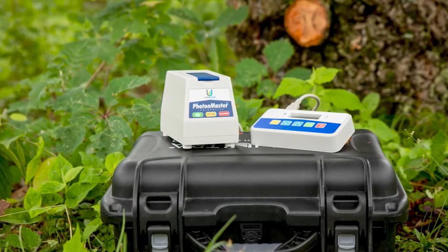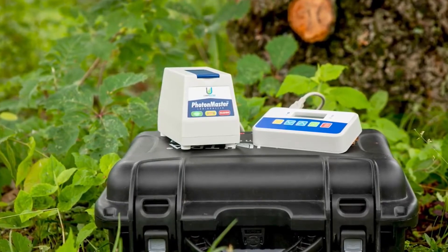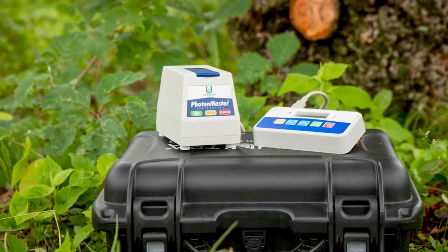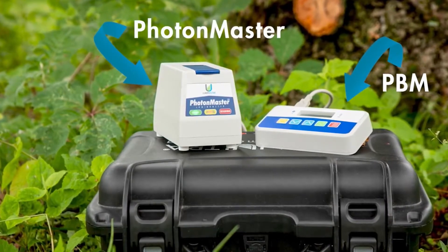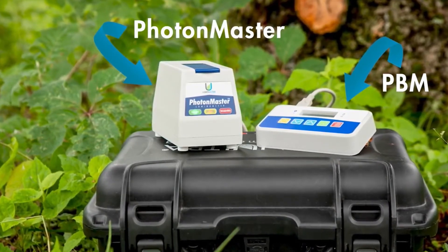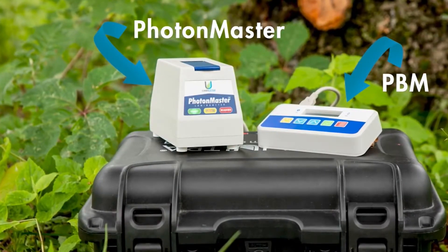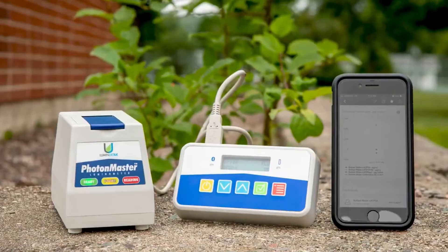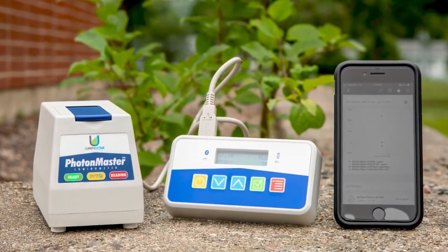The PhotonMaster Bluetooth Module, or PBM, is a device that MyLumin Ultra users need to read the data that they collect using their second generation ATP test kits. When connecting this device to the PhotonMaster Luminometer, users can obtain the most information about microbiological growth in their process and can record data in the MyLumin Ultra software on both web and mobile. This video will show you how to connect the PBM device to a mobile device.